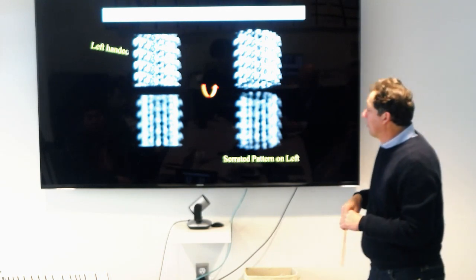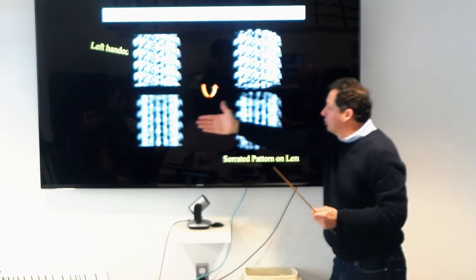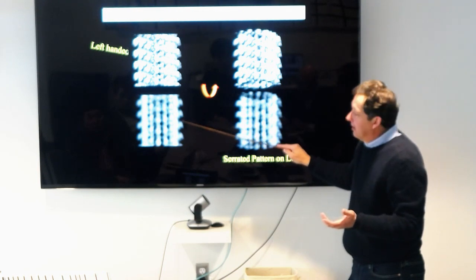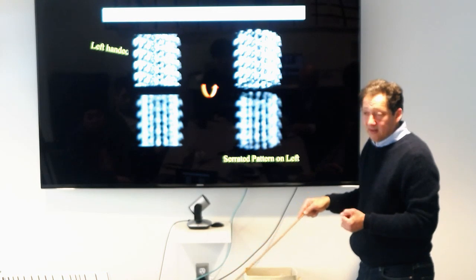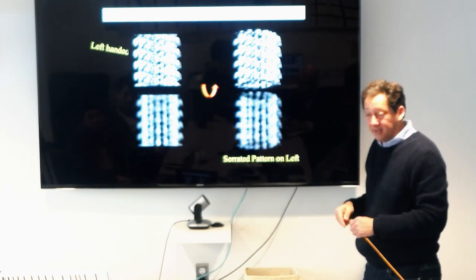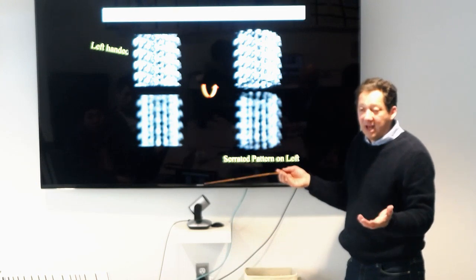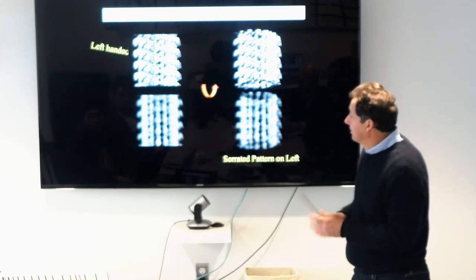So that will tell you. Of course, you don't have that in the image. That will be your first. You do this experiment and say, aha, we have a left-handed helix here, and if you see this distance, you also know the pitch, so you know where that helix is going to appear in your diffraction pattern, and you can see the radius here, so you know approximately what Bessel order should be.